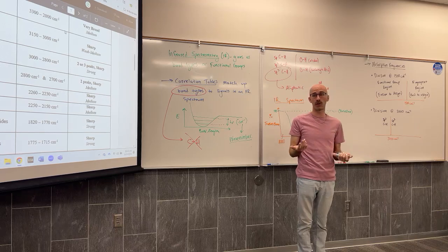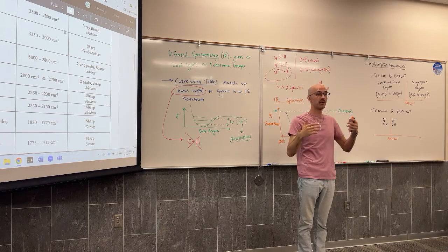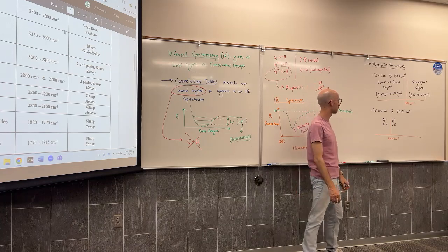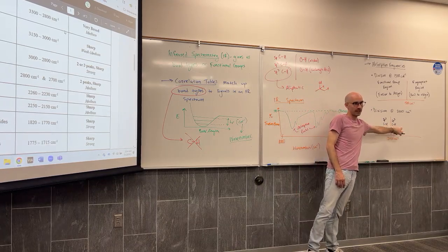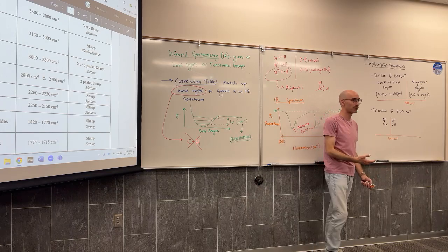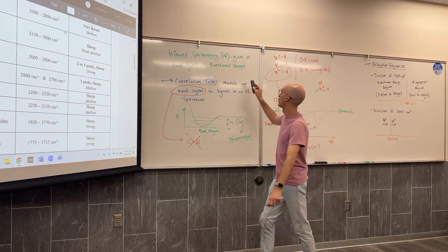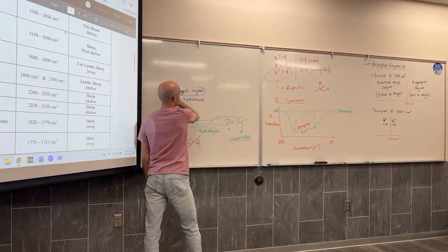And that's really important for organic chemistry because it tells us, do I have anything aliphatic? Do I have any sp3 carbons? Do I have any alkenes? Do I have any aromatic rings? Anything that is sp2 CH? So this is a really important distinction, but to clarify, your textbook doesn't highlight it. So I expect you guys to see it. If you go reference the physical textbook, they won't highlight it. I think that free online textbook that's linked as a resource, I think they do actually highlight the distinction.